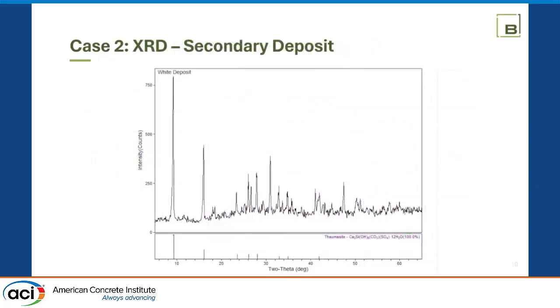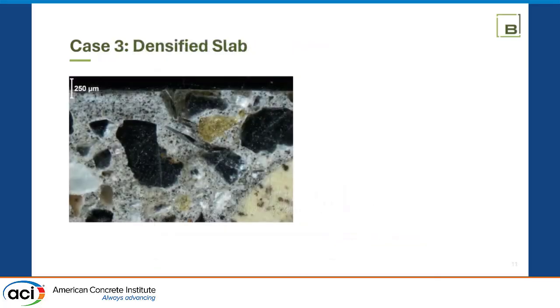In 60 minutes, I could take that same product, put it through the XRD, which I will, as I told you, love, and find out that white deposit is thaumasite and get the actual mineralogical makeup. And that's a type of orthogonal analysis that we do quite frequently if we can to verify what we're seeing. Coming at it from multiple different angles to confirm what we're seeing.